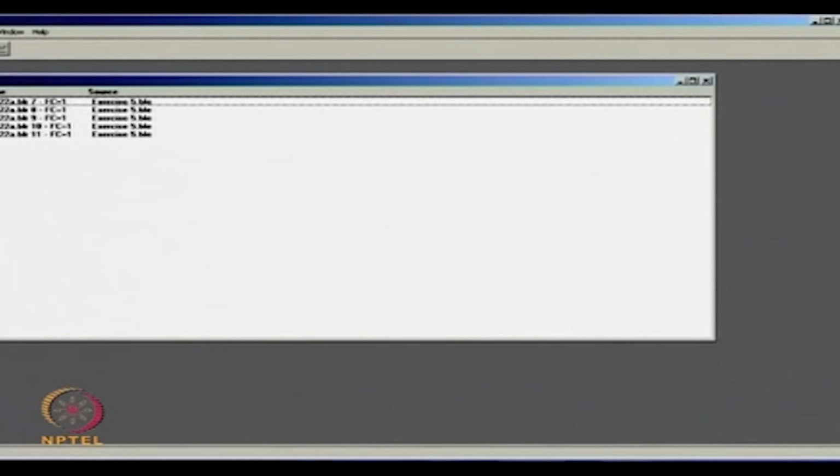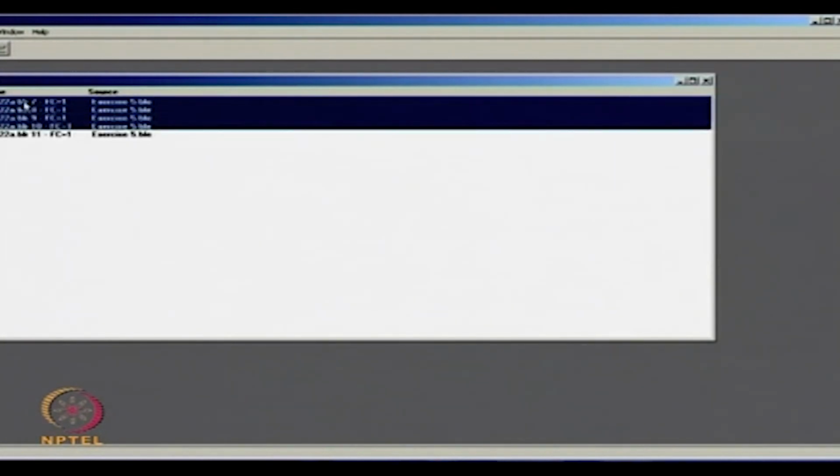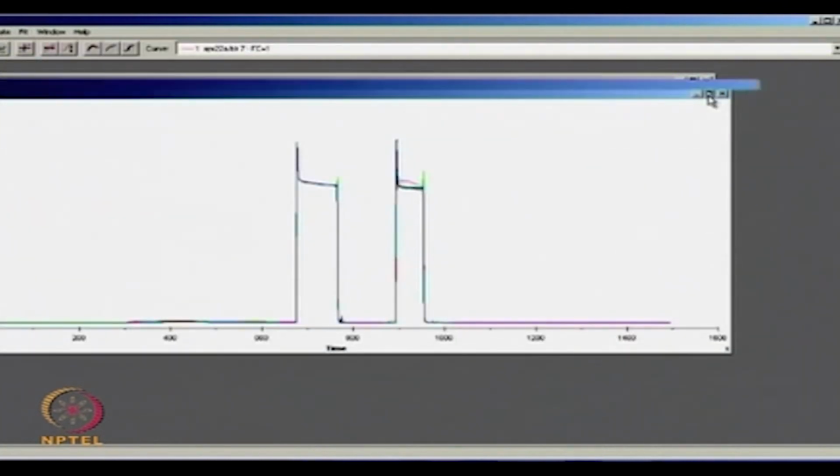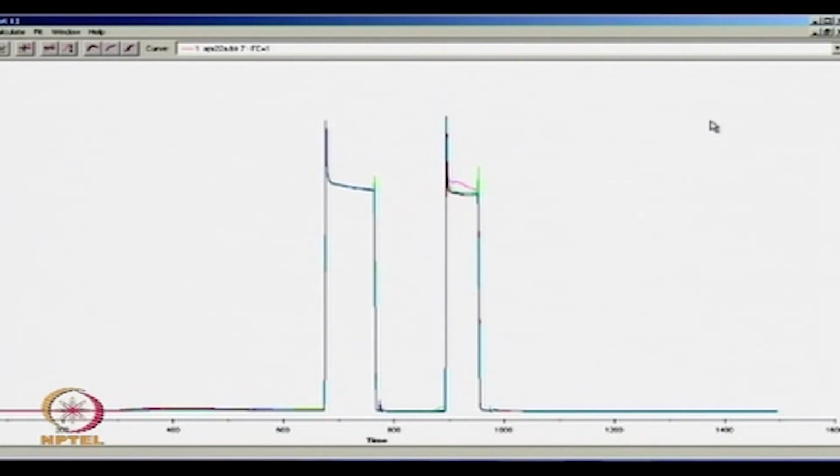Sure. So if you can see my computer, I'm going to open a typical Biacore result, and here is a Biacore result. This is a Biacore result where 5 samples of different concentrations were run over a fixed ligand which was on the chip, and now I'm trying to do kinetic analysis. So if you look at these 5 results, I select them and I show the results, and these are the results. Now this is what a typical result looks like, and there's nothing to be worried about because it looks odd. The idea is that your results are all embedded somewhere here.